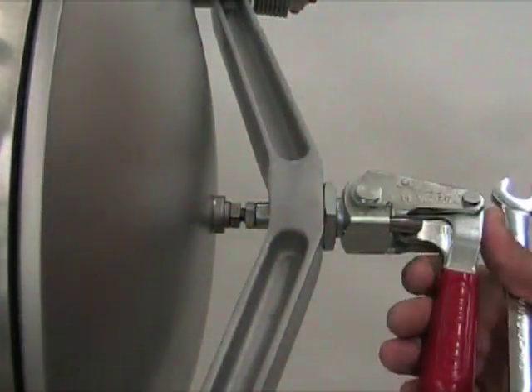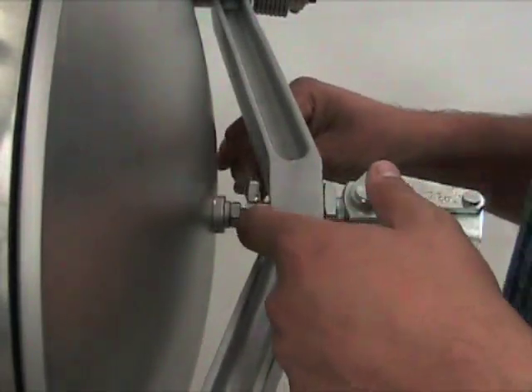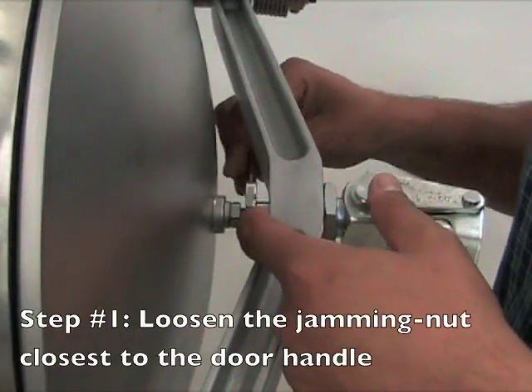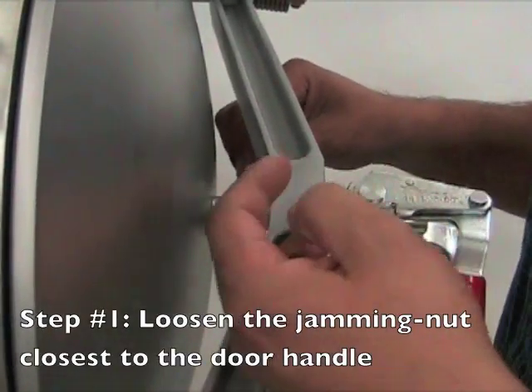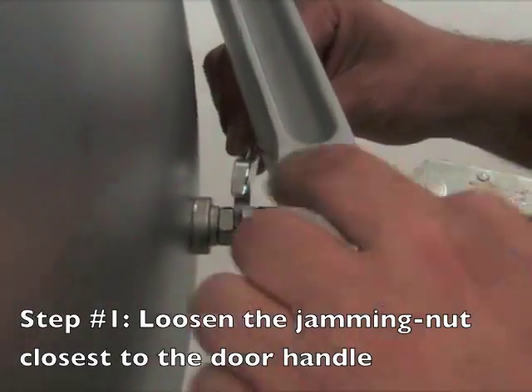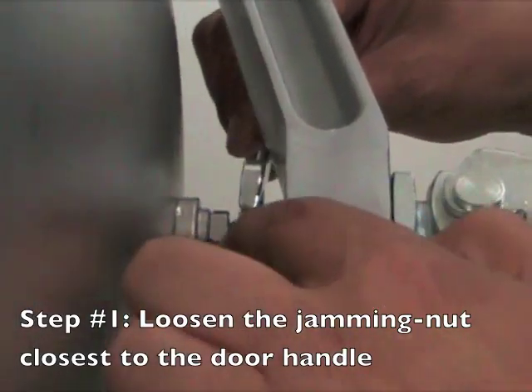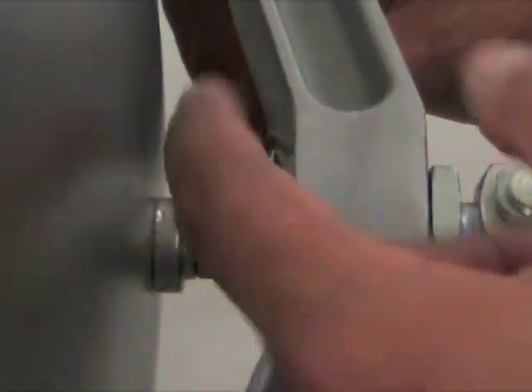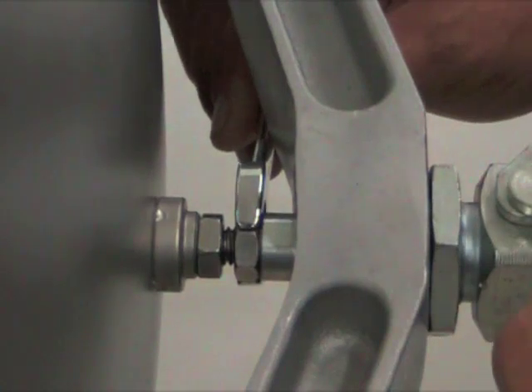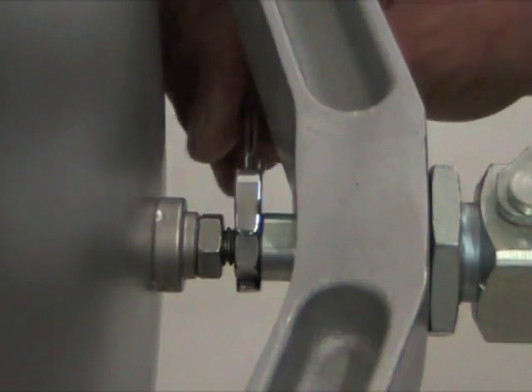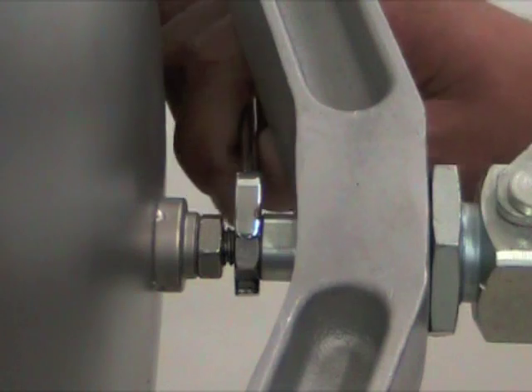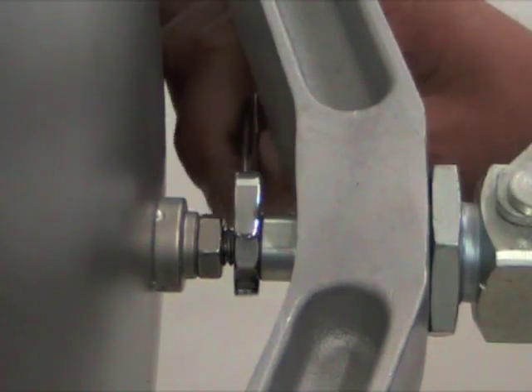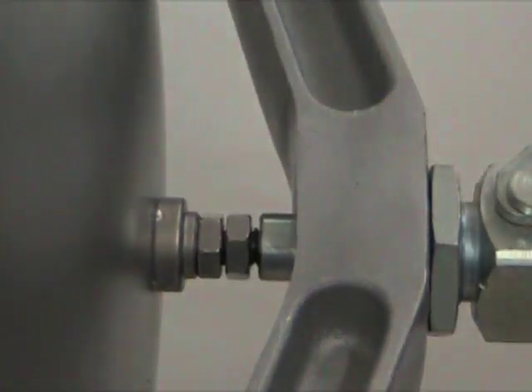To begin, you want to loosen the jamming nut closest to the door handle. There's a couple of jamming nuts so you want to loosen the one that's closest to the door handle away from the anti-chamber door. To loosen, simply install your wrench and turn clockwise.